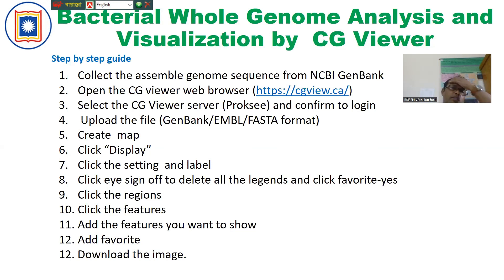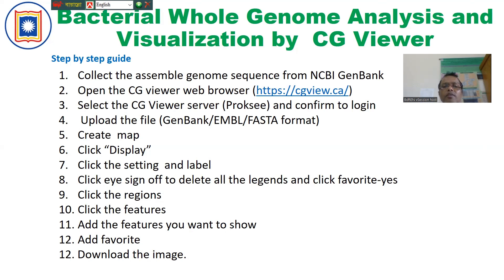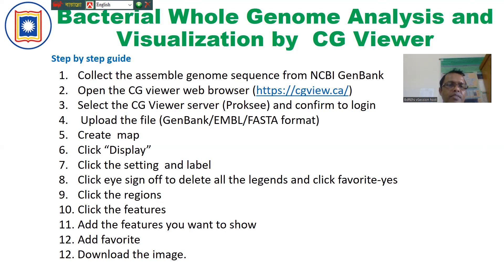First, we have to collect the assembled genome sequences from the NCBI database. I will show you an example, but you can also use your own assembled genomes to analyze for visualization and annotation in GenBank. Then you open the CGViewer web browser from the website mentioned here. Select the CGViewer server, which is also called Proksee. Before uploading your genome, you have to log in and upload your genome in GenBank or EMBL format. Then you have to take a little time to create a map.